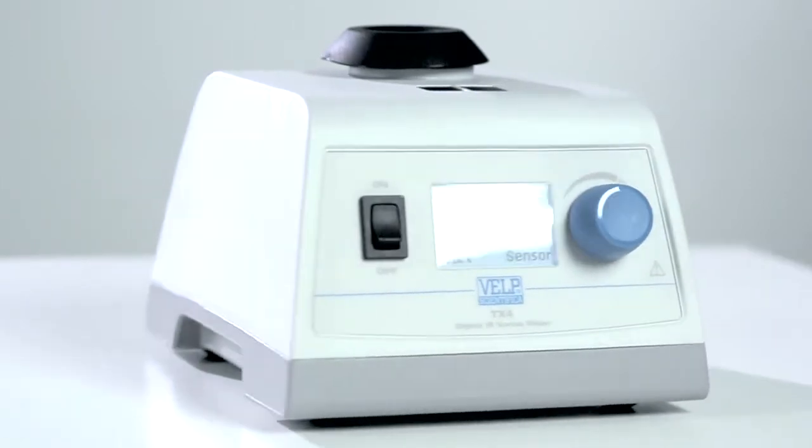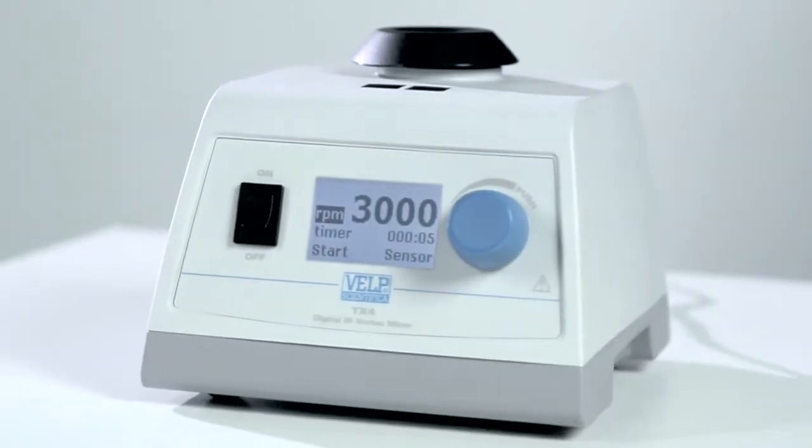When you think about your lab, a mixer is one of the objects you use most in your daily routine.